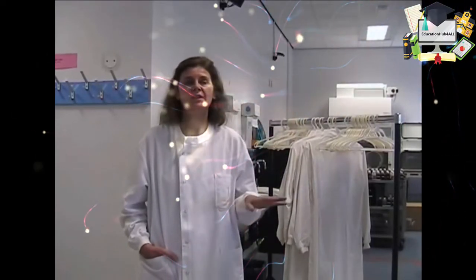Now, there's certain rules we have working in the microbiology lab. In addition to wearing your lab coat, you never ever bring any food or drink into the lab. Nothing should touch your mouth. No chewing gum. You don't put your fingers in the mouth. You don't put the end of your pen in your mouth. That completely avoids risk.